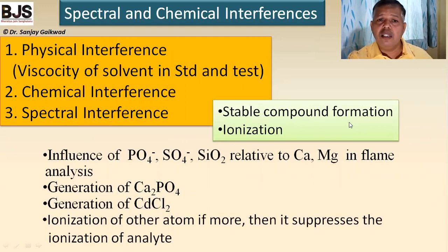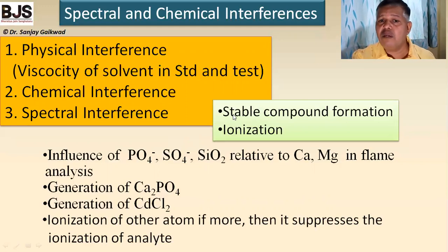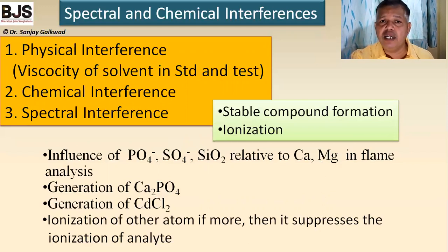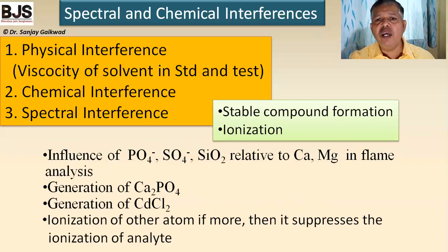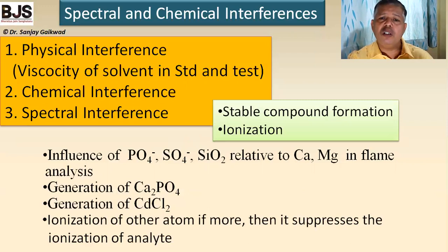Chemical interferences include stable compound formation in solution. If a metal forms insoluble compounds, it cannot be aspirated into the flame and therefore cannot be detected. For example, if phosphate, sulfate, or silicate ions are present in solution, the metal may form insoluble phosphate, sulfate, or silicate salts which remain in solution and are not aspirated. Such chemical interferences must be identified and removed by changing the preparation procedure.